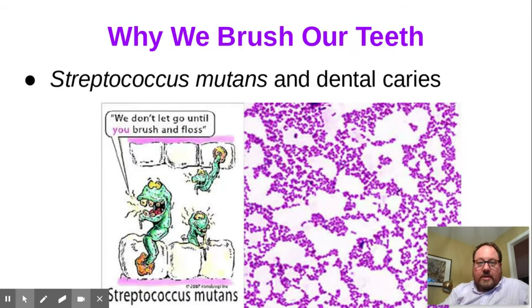All right. So one way to envision cells is by thinking about their size. For a long time, people had no conceptualization of what cells were, but cells have profound impact on life because cells are what do the work of life. Now, one instance of being able to see cells here, it's these little streptococcal bacteria.